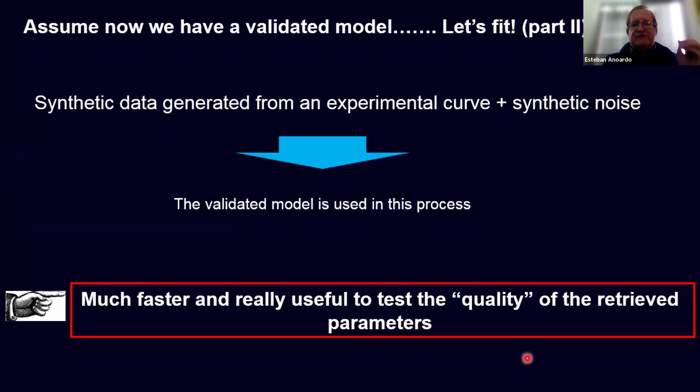So what we use to generate these synthetic curves is the validated model, the model we have already validated before. This is much faster, and you can generate a lot of curves per day, and you can do a large quantity of fittings to test if the thing, we will see what the thing is, is working okay.